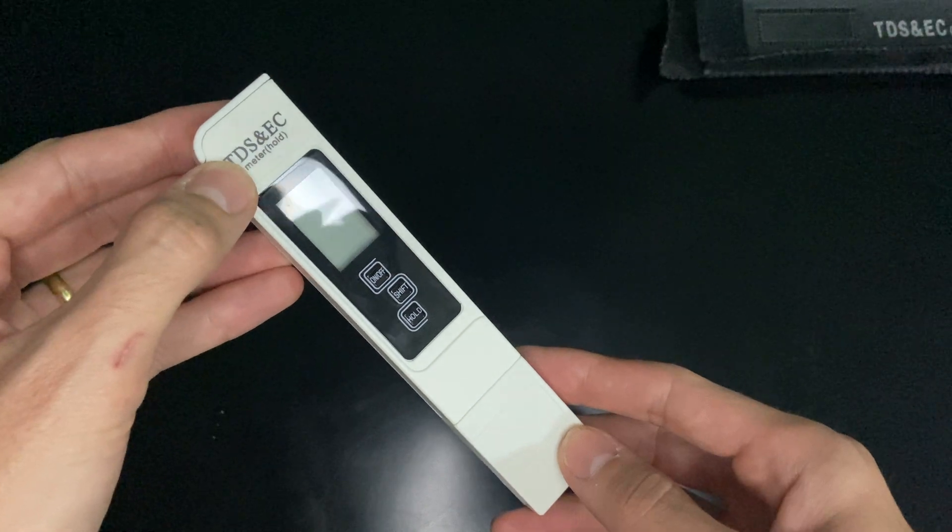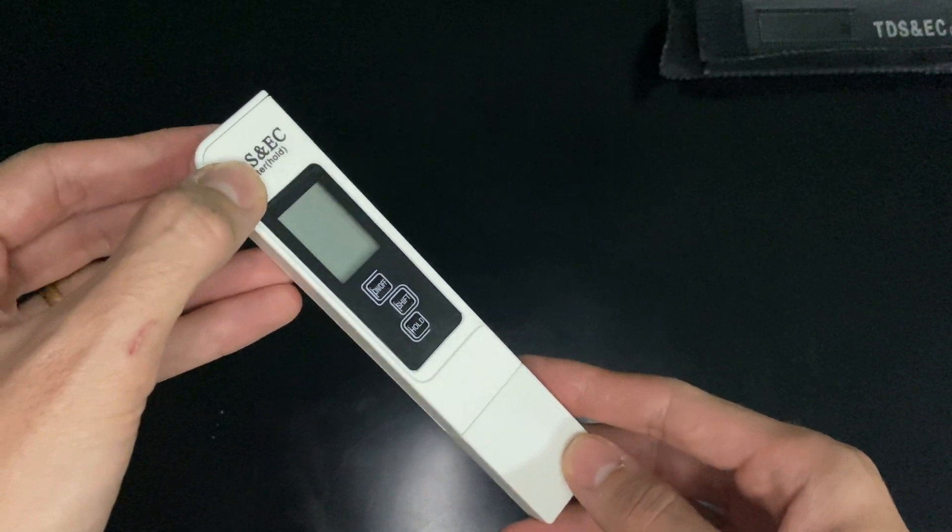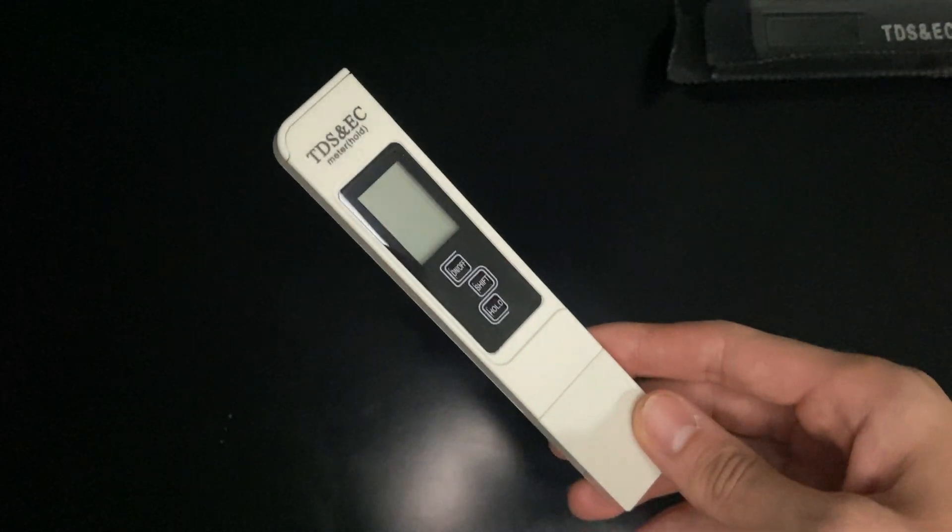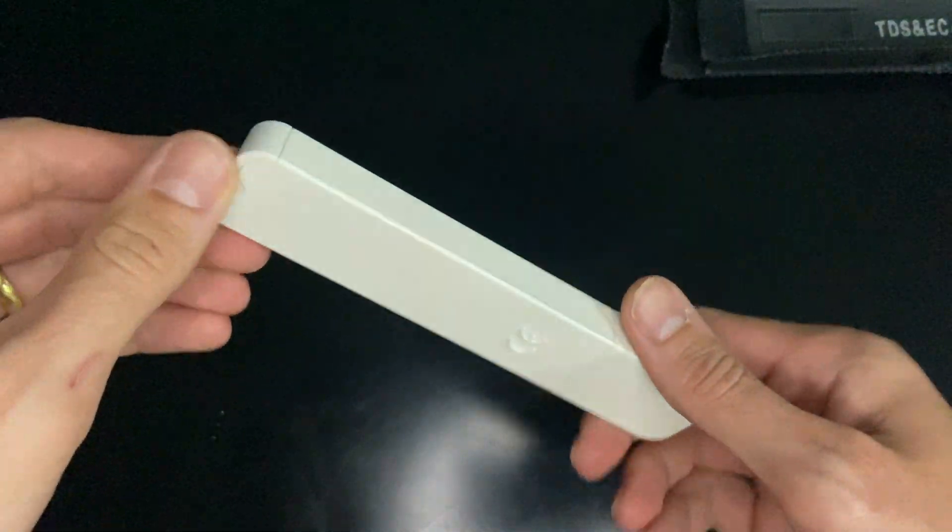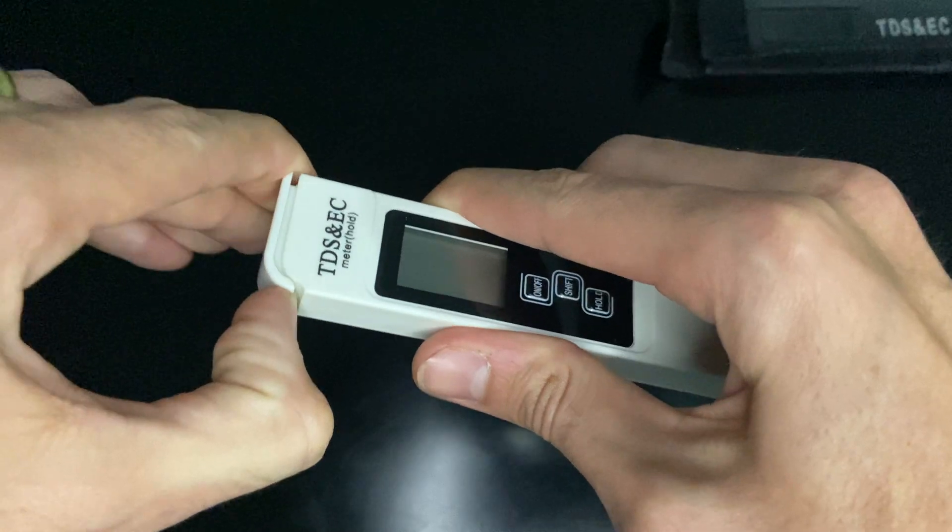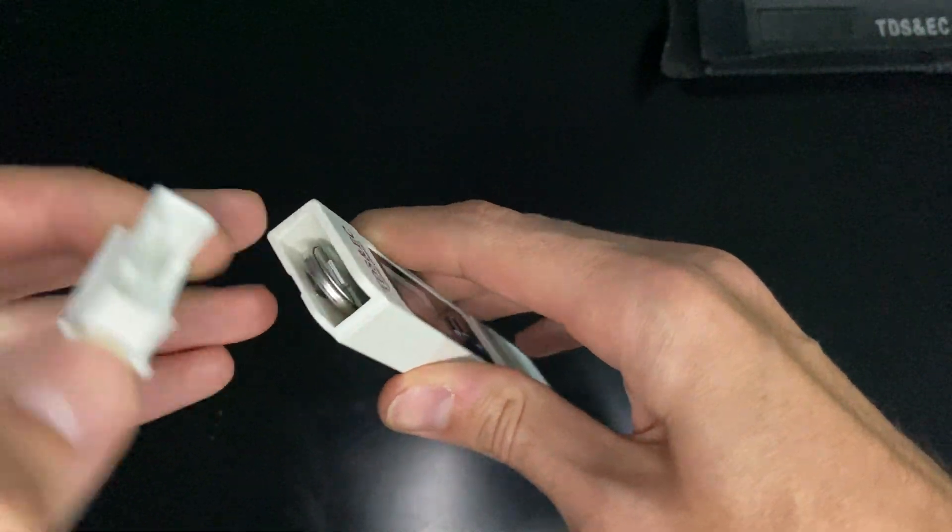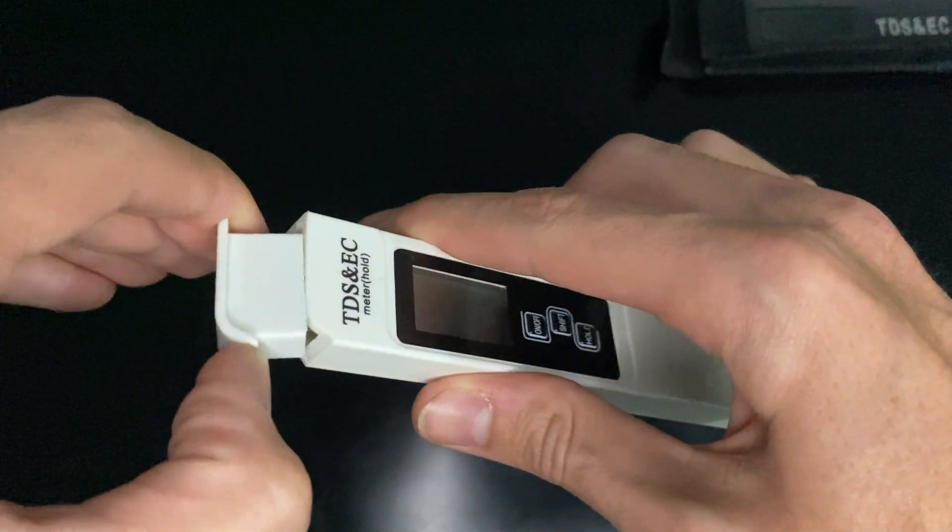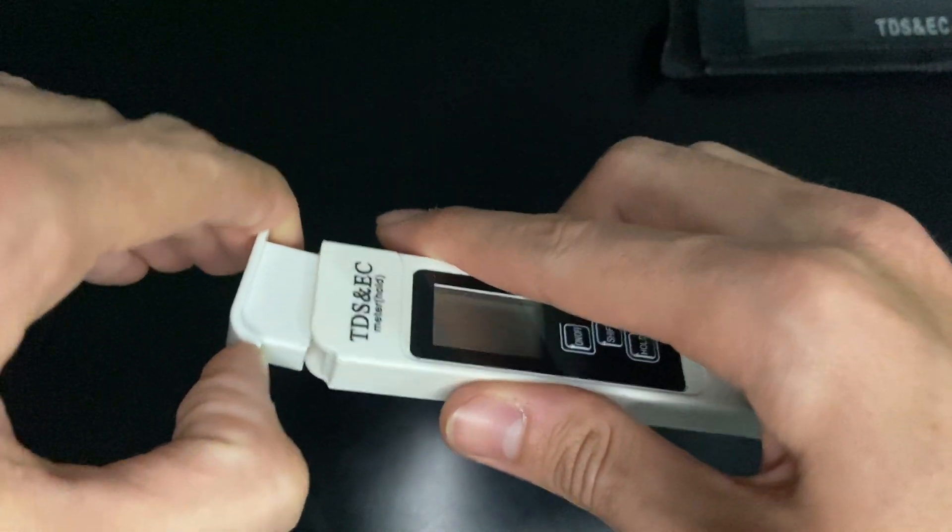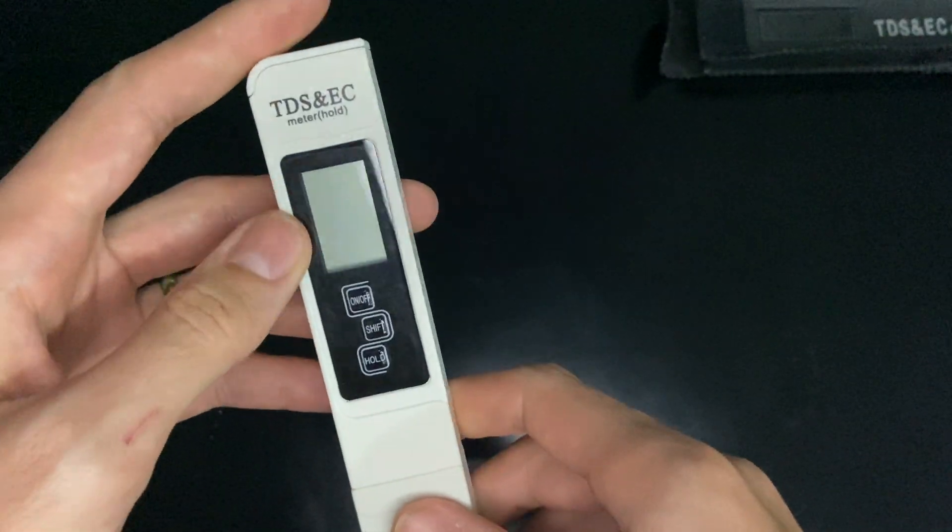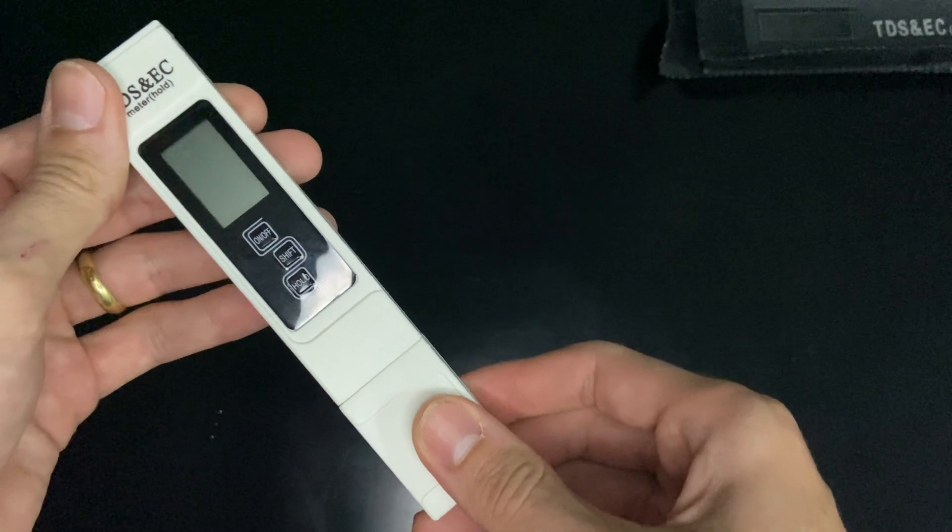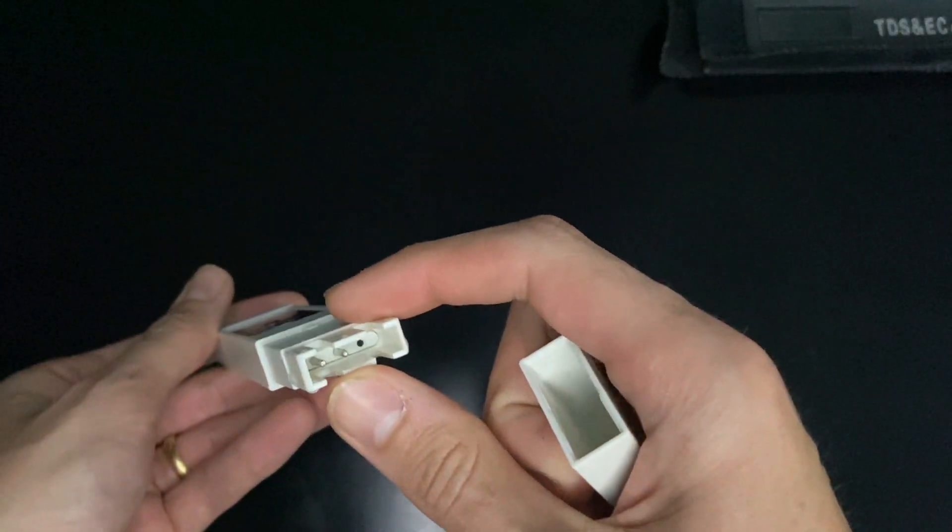It came already with the battery. As you can see here at the top, it's a watch battery, CR 2032. How does it work? This pen has two metal probes here.